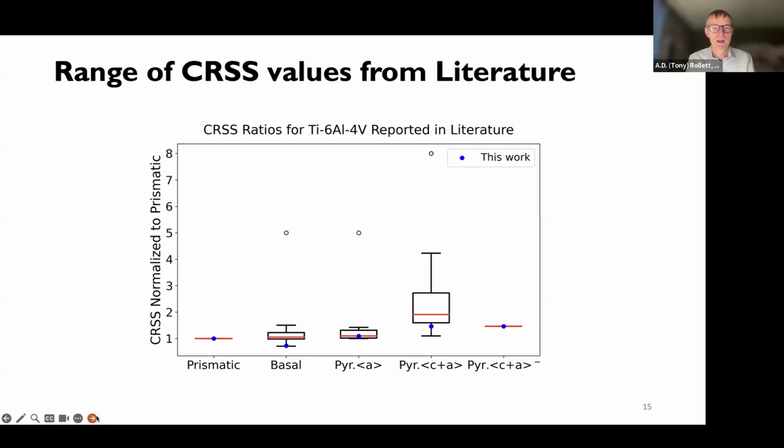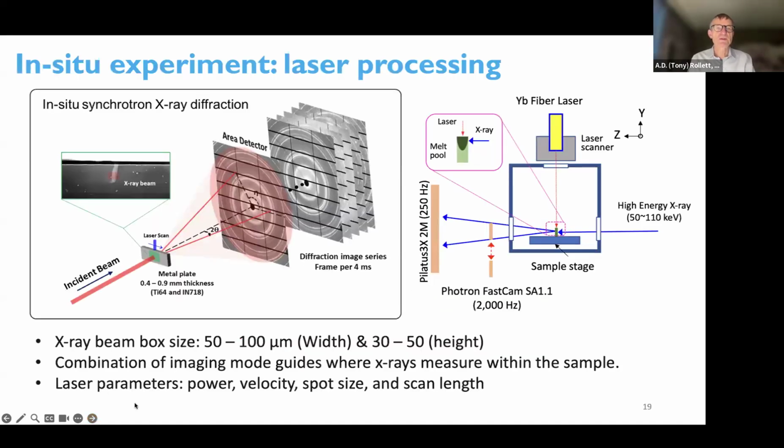Yep, of course. All right, so now I'm going to talk about high-speed X-ray diffraction. What I mean by high speed is that we've been lucky enough to get a good amount of time to do experiments at a synchrotron. The synchrotron that we've typically gone to is the Advanced Photon Source near Chicago. The idea is you have a beam of very well monochromated X-rays. The energies are typically 50 kiloelectron volts.